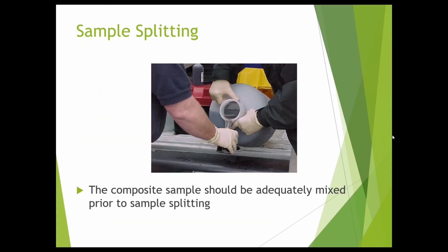And then when you split a sample, or when you're sharing a sample, you're pouring a sample up, it's in a large container. Again, gravity takes effect, the solids sink to the bottom. Anything that's light floats to the top. You want to put a lid on it and shake it up really good.